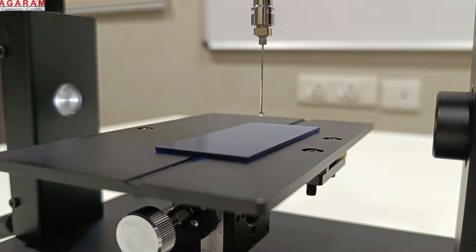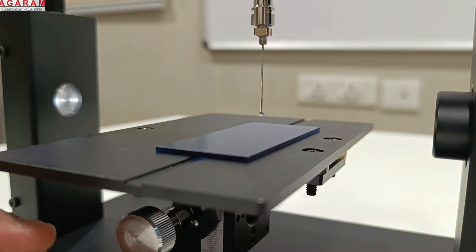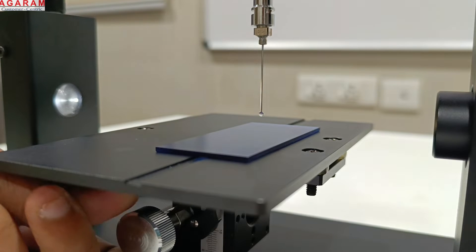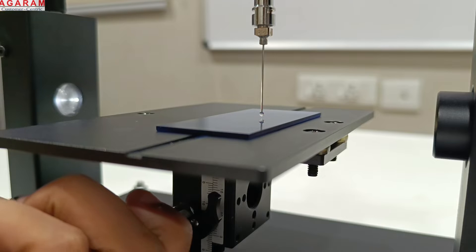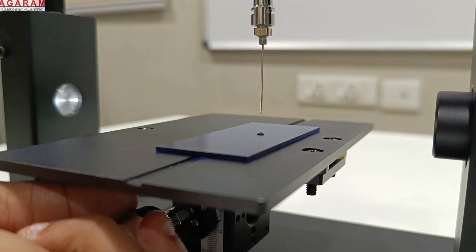This device helps quantify the hydrophobicity, hydrophilicity, wettability, spreadability, surface cleanliness, and many such parameters.